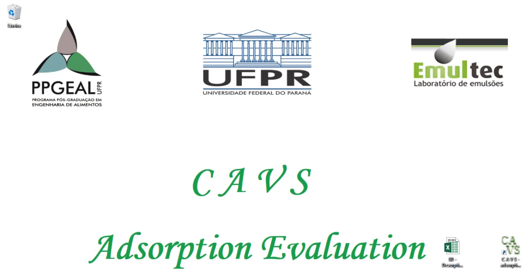Hello everyone, in this tutorial I will show you how to use the menu Desorption Kinetics Modeling. This module was developed to fit models to the experimental data of desorption kinetics. Initially, it is necessary to prepare the sheet with the data.